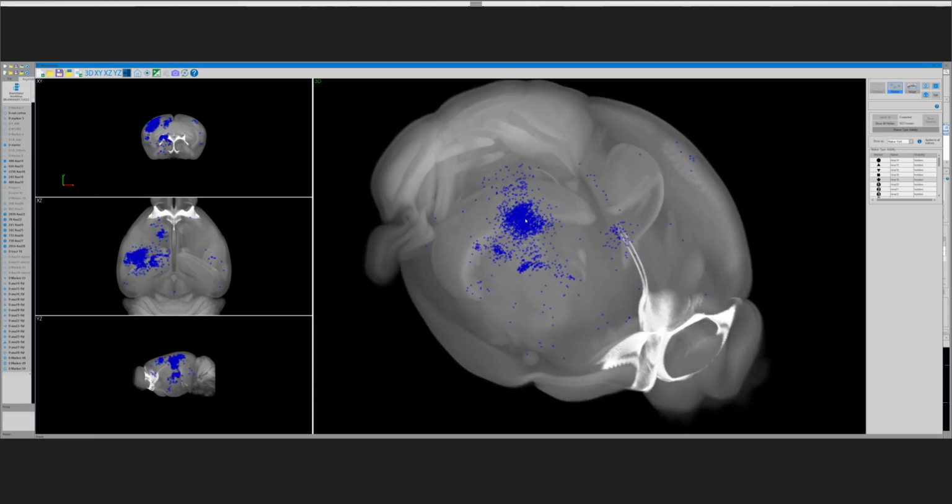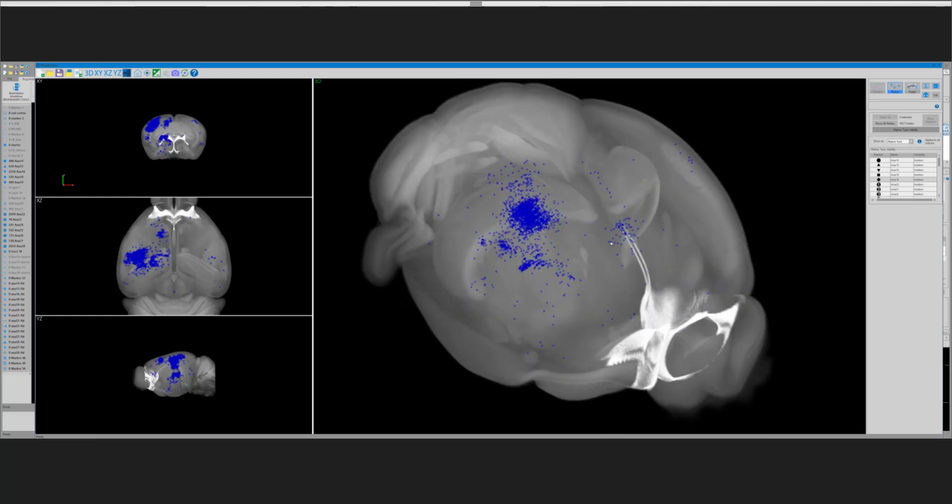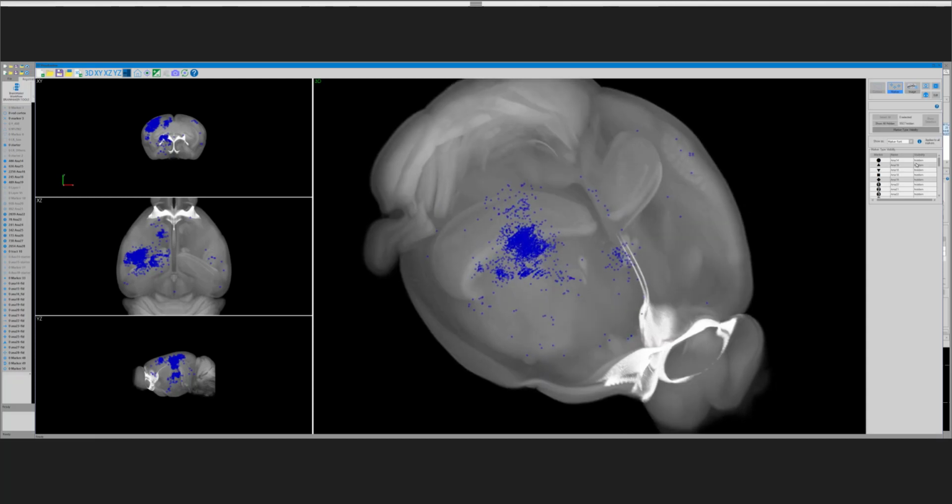This is the primary injection in the neurons. These are individual neurons that are projecting to an individual neuron in the somatosensory cortex. So all of these are transsynaptically labeled from this one injected neuron. Most of the neurons that project to it are local, in the adjoining primary somatosensory cortex, but then there's a region in the secondary cortex and then the thalamus and prefrontal areas, contralateral areas. And then we can combine and look at other cases and see how they relate.